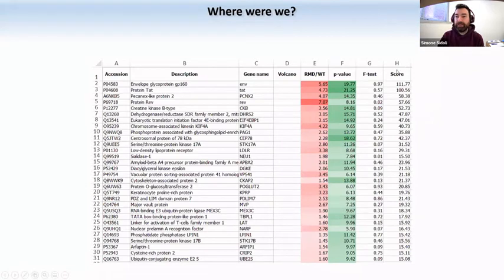And then we created this arbitrary score to help us sort the table for the most interesting proteins, proteins that have the strongest fold change and p-value, to get them at the top of the table and make our visualization easier. But still, at the end of a proteomic experiment, you might end up with tables of 5, 6, 7,000 proteins and maybe 1,000 regulated features.